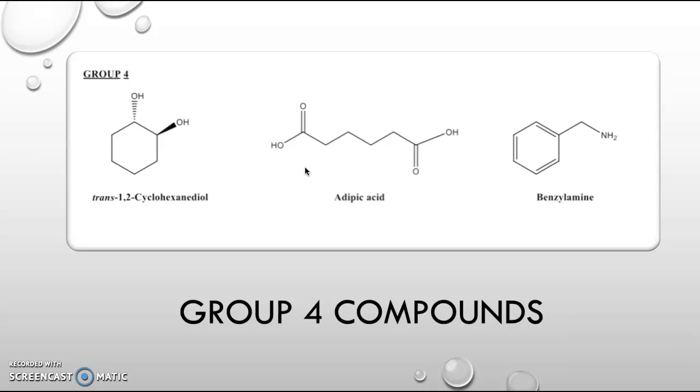And on the IR spectrometer, when you lift the lid, there's a place where you can slide your sample in. You would slide it in, and then close the IR spectrometer, and then go onto the software you're using, and you would collect a background spectrum, so that you could have an accurate reading of your sample. And that is all.